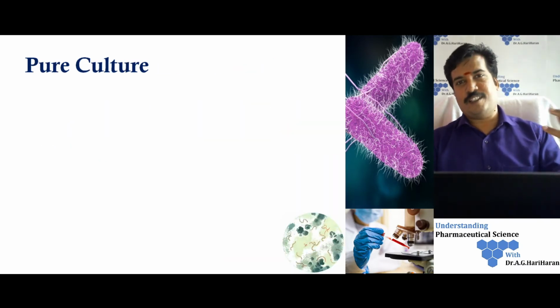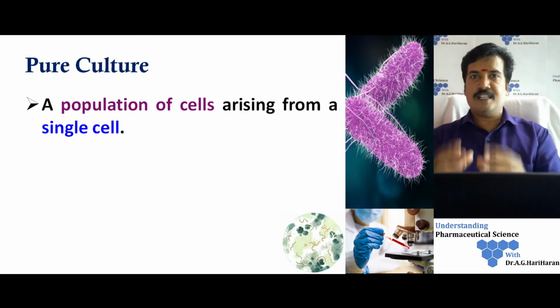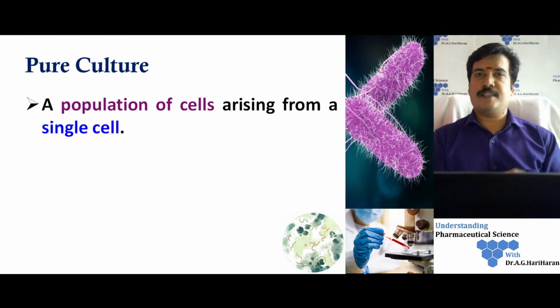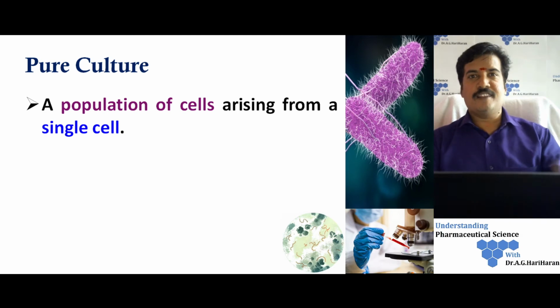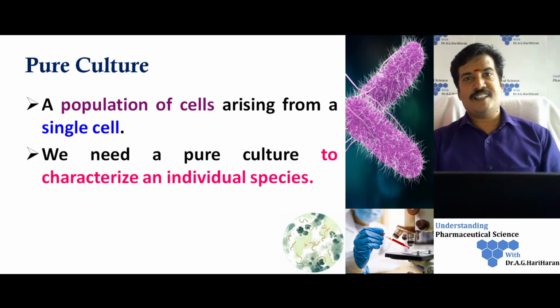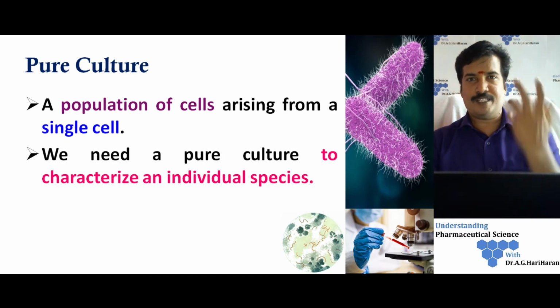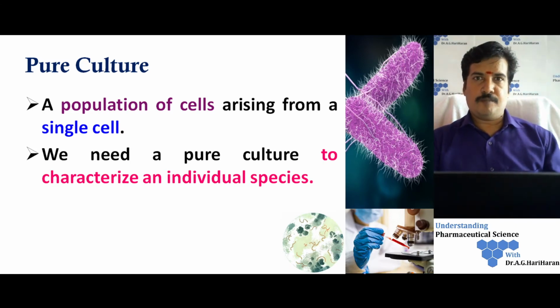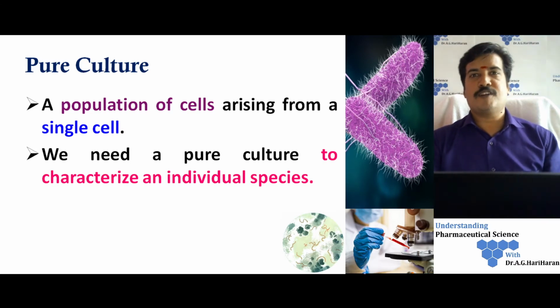A pure culture means a population of cells arising from a single cell of a microorganism. Each cell divides and forms a colony, and this colony is regarded as a pure culture. Pure culture is essential for the characterization of a microorganism of a particular species. We perform various types of morphological, biochemical, or even genetic characterization, and for this we need the organism in a pure culture stage.